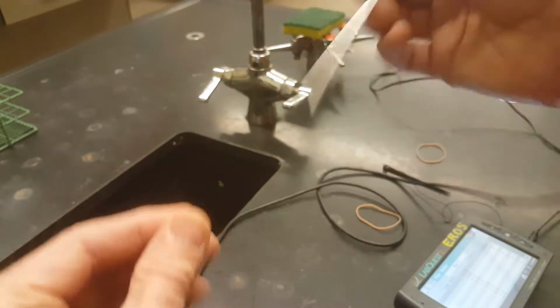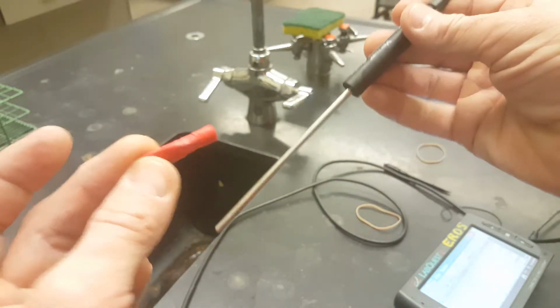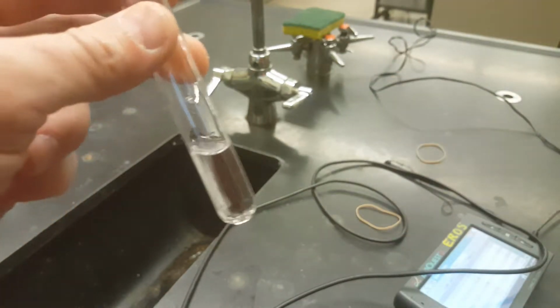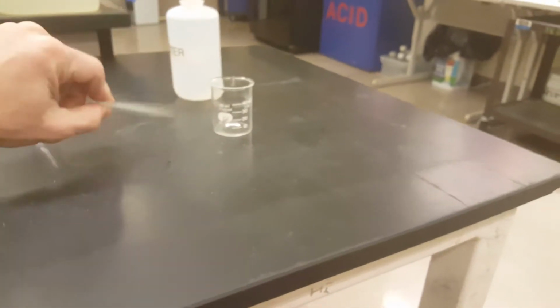The first thing, after you do each test, just take this off and throw this in the garbage. Please don't leave anything in the sink. The next thing, take your test tube and put this back in the beaker that's in front of the squirt bottle. Since mine was water, I'm going to put this right back in the water.